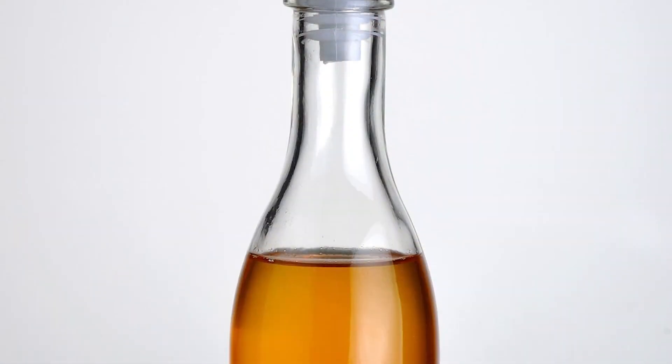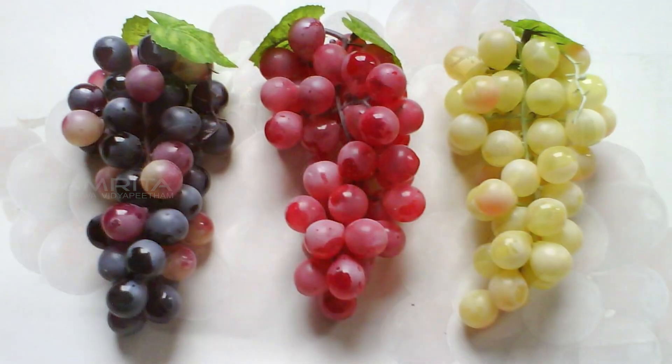Lemon juice, vinegar, grape juice, etc., are examples of acids.